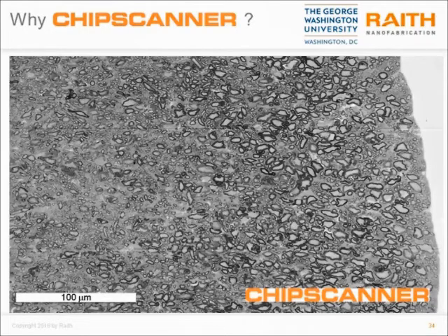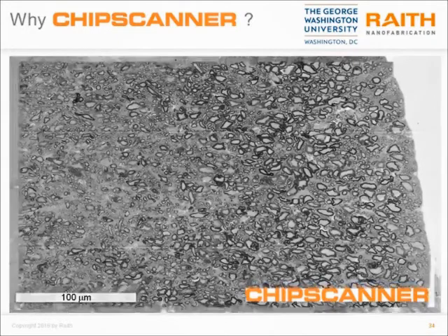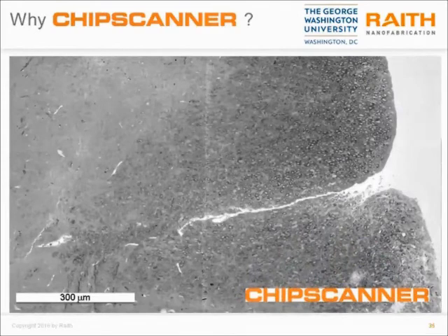Again, these are not displacements in X and Y. These stitching boundaries are due to changes in signal intensity, which is another dimension of stitching errors. And signal intensity changes can occur quite easily if there's damage happening to the sample or charging. This can change the signal intensity, and therefore it's quite common to find these boundaries of signal intensity in these stitched images.